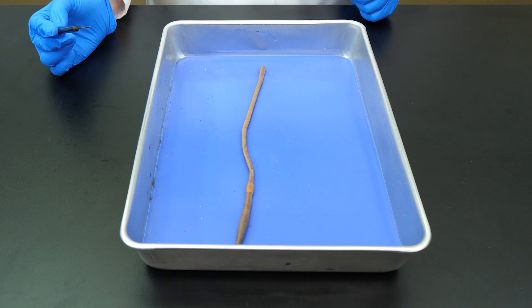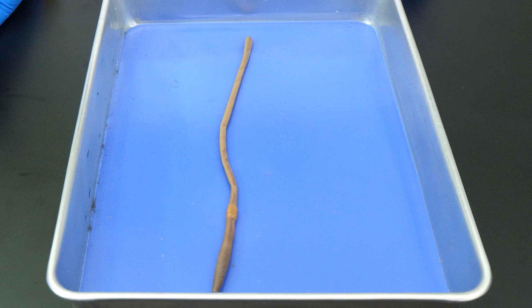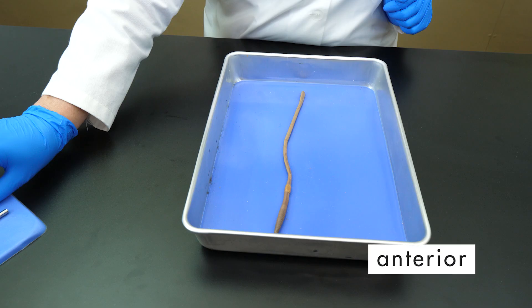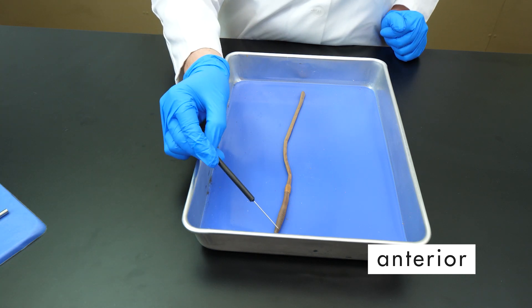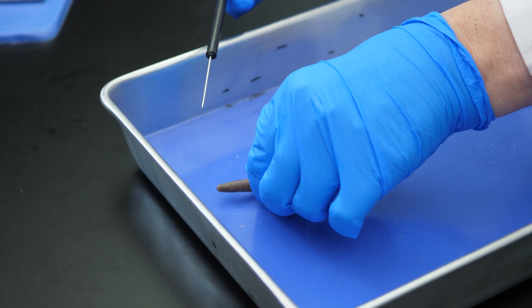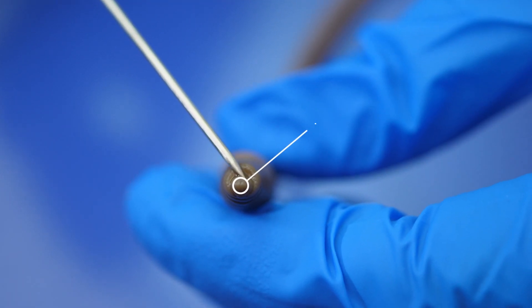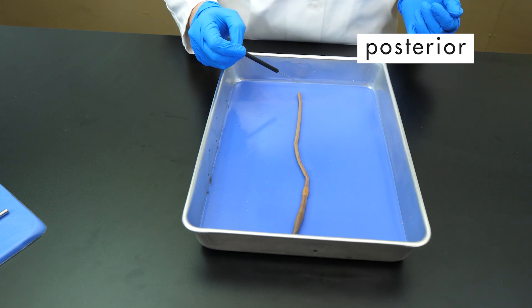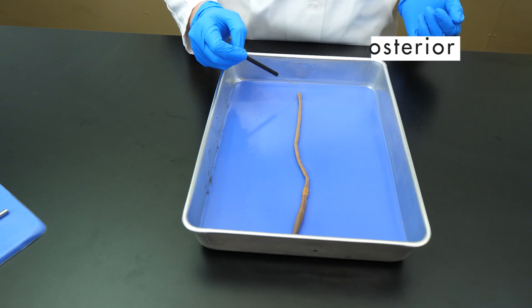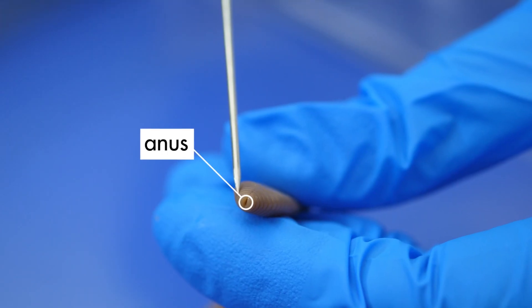We need to identify the anterior and posterior regions of the worm. At first glance, it may seem that both ends of the earthworm are the same, but the anterior end is the one closest to the clitellum. The mouth is located at the anterior end of the worm in the first segment. The posterior end is the end farthest from the clitellum, and the earthworm's anus is located in the last posterior segment.